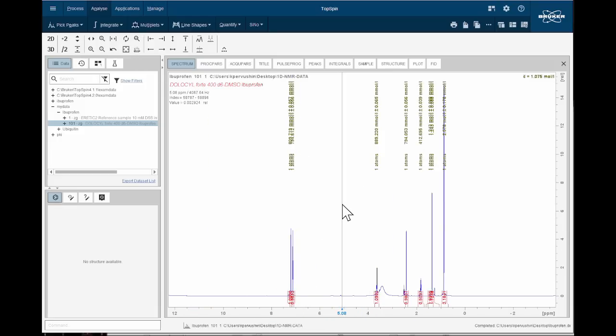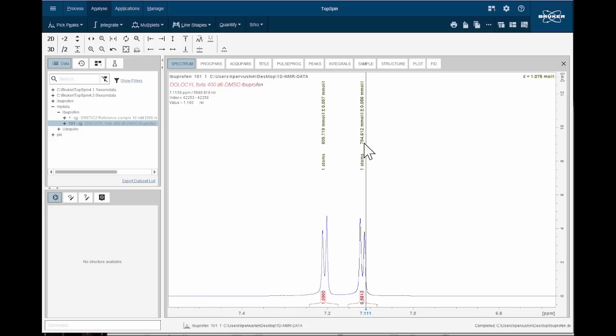This concludes our validation. We validated it, and we established its concentration, which would be about 794 or 800 millimolar. Because this is a single proton, we can really take this number as the concentration estimation. So 800 millimolar. And we established that the contamination level is below 1%, significantly below 1%. So it's a good preparation. Yeah, that's the conclusion.